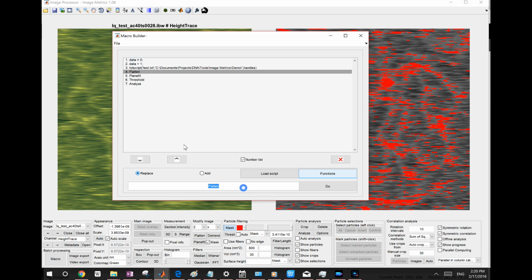You can also write your own MATLAB code. I have the application program interface in the documentation. You can look at that so you know what variables and what functions to call for each individual function, like buttons and UI controls. For example, if you want to run a section analysis, or change the filters of area and volume, you can basically do that.